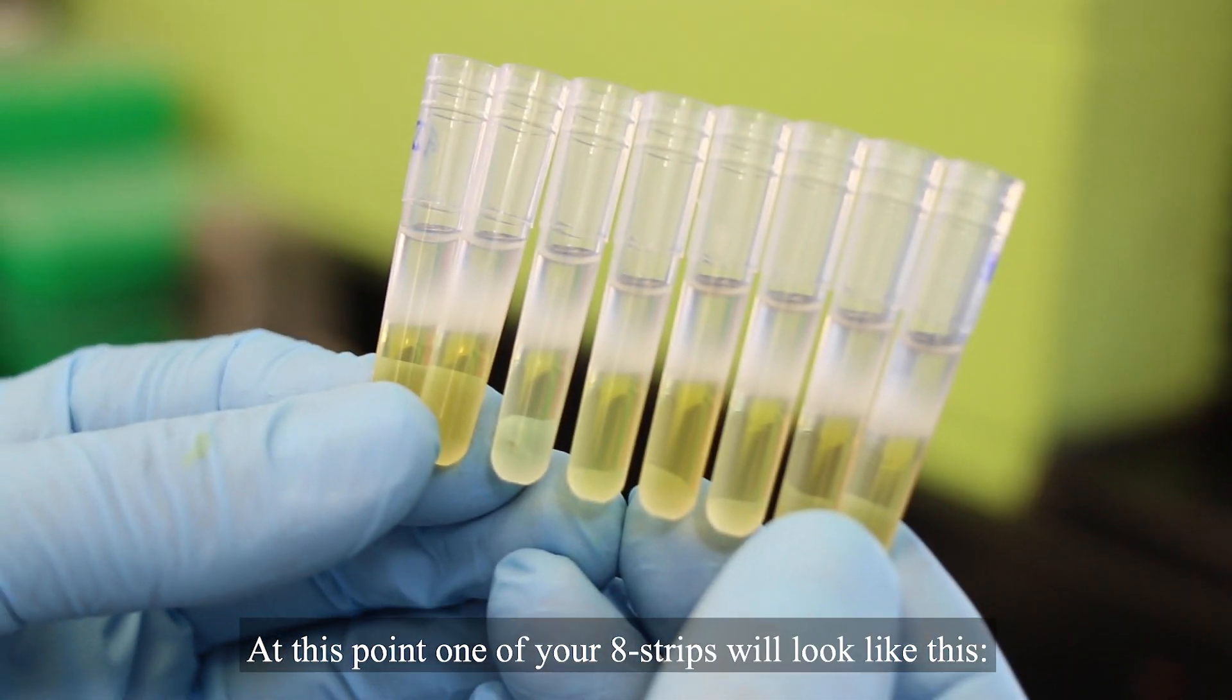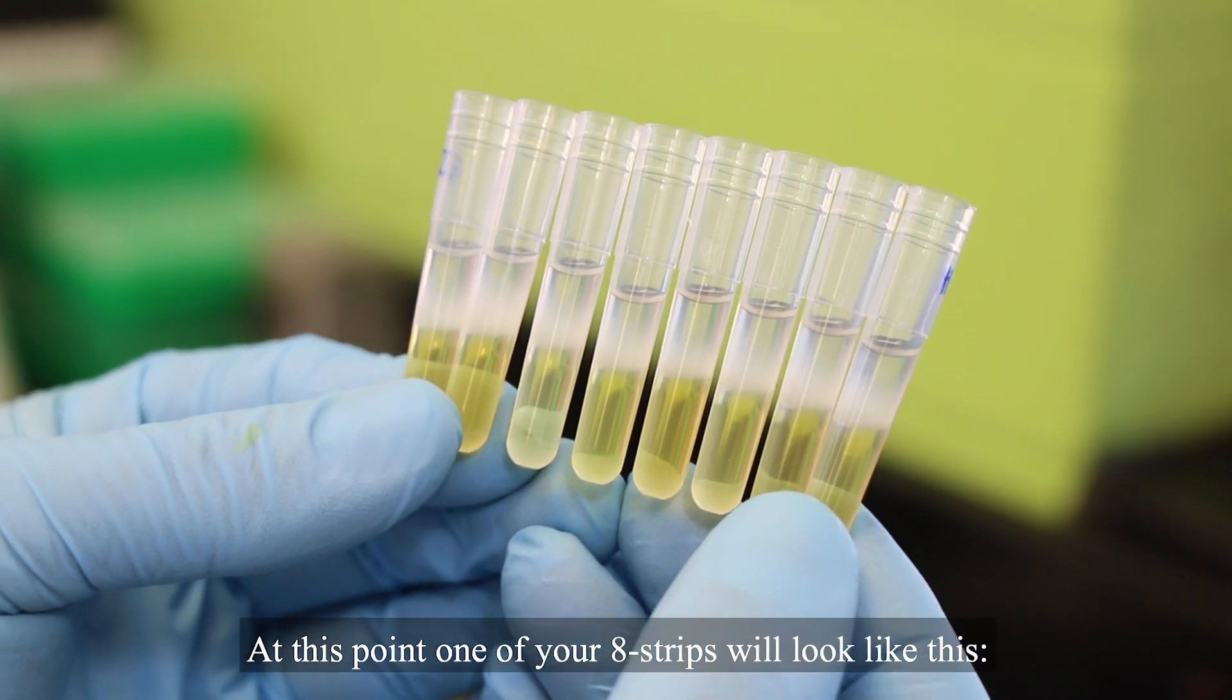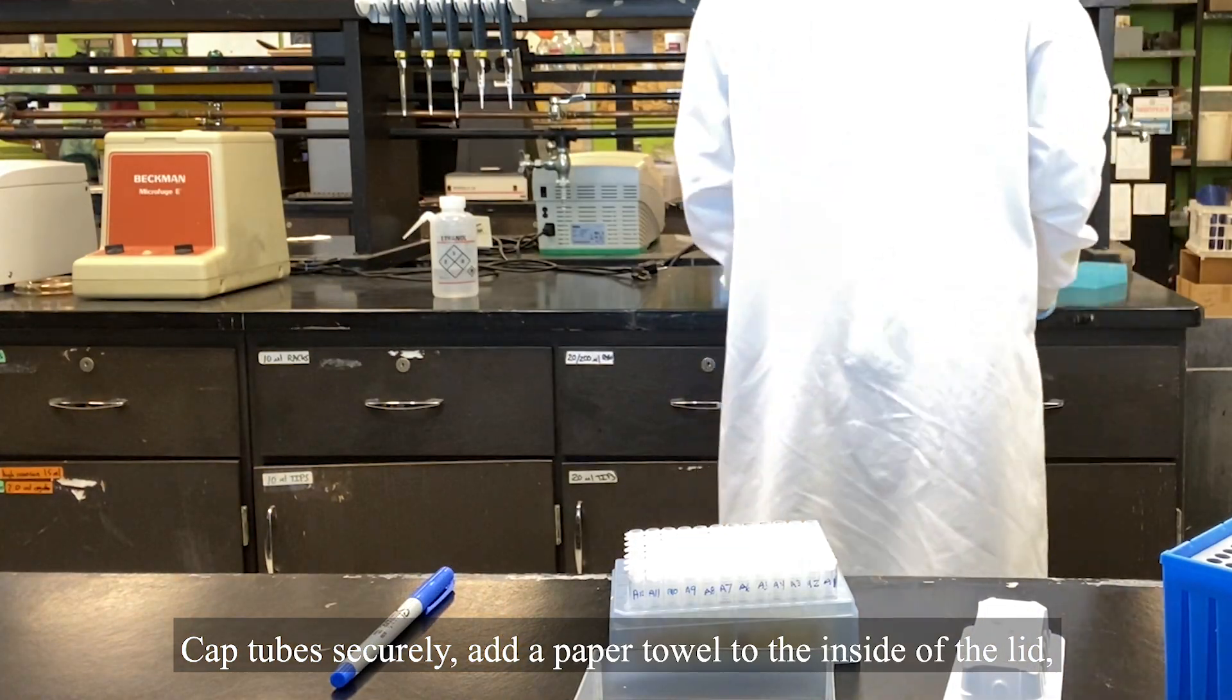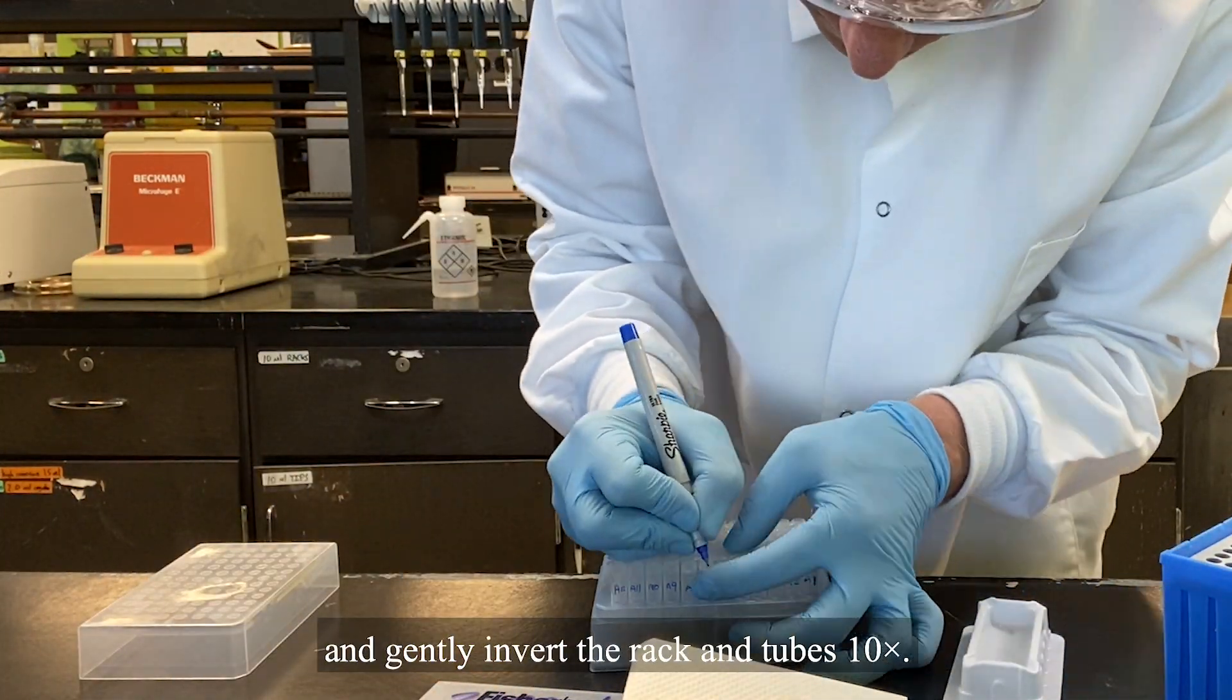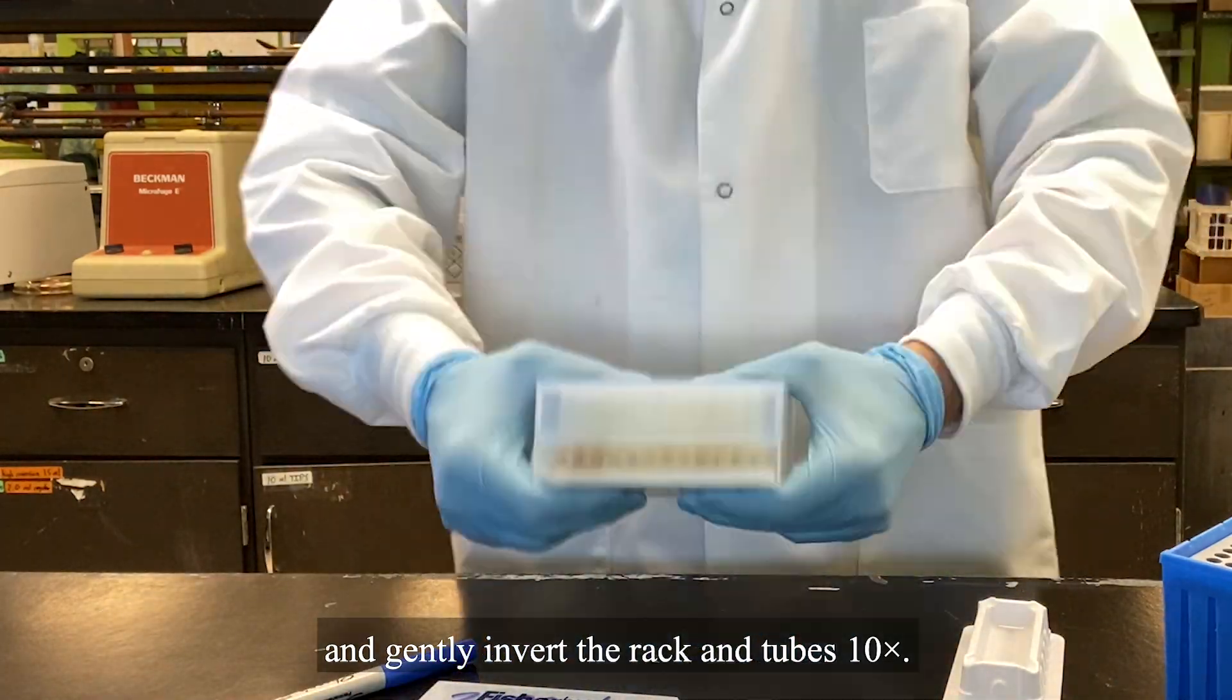At this point, one of your eight strips will look like this. Cap tube securely, add a paper towel to the inside of the lid, and gently invert the rack and tubes ten times.